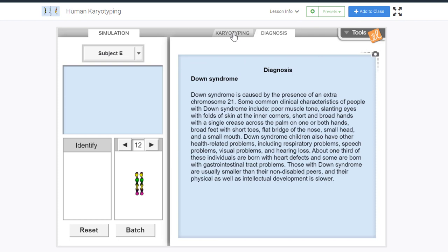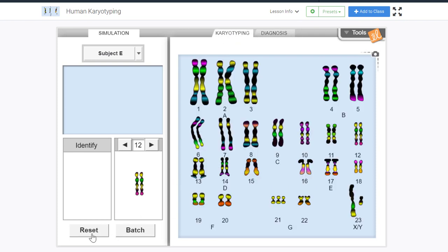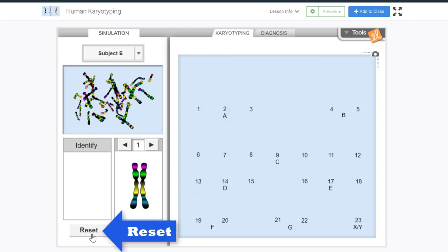The reset button will remove all of the chromosomes from the karyotyping tab and return them to the starting location. As easy as grabbing and dragging we can discover diagnoses or sex of a subject through the matching of chromosomes.